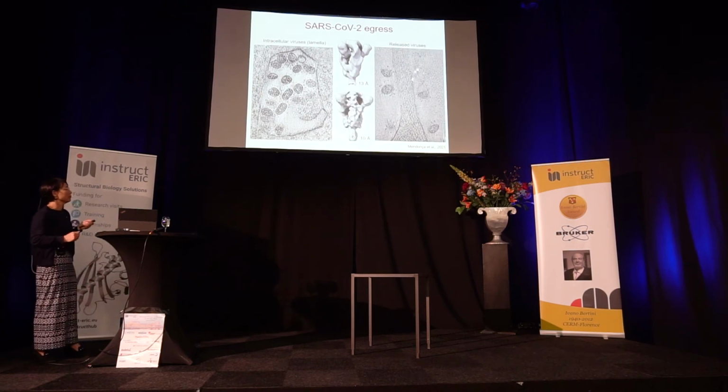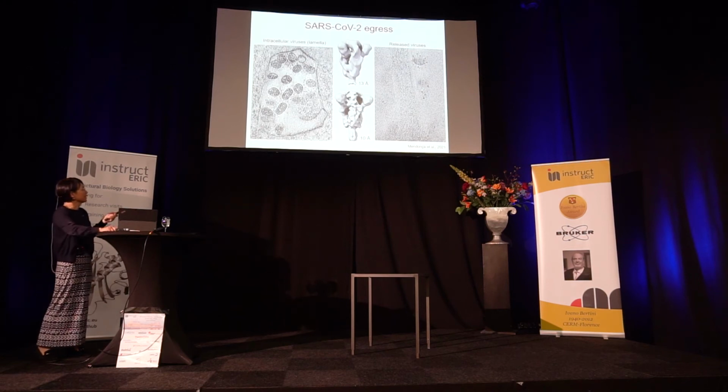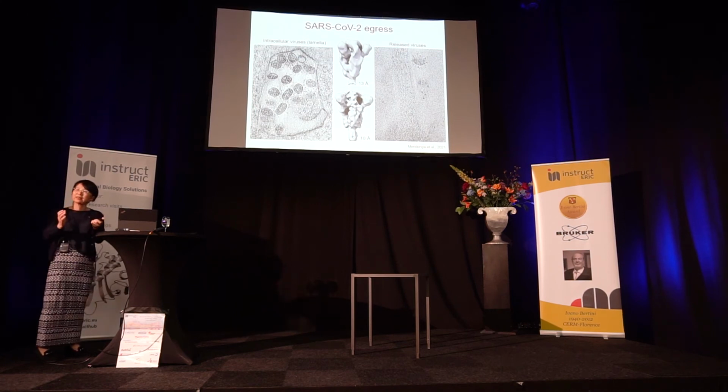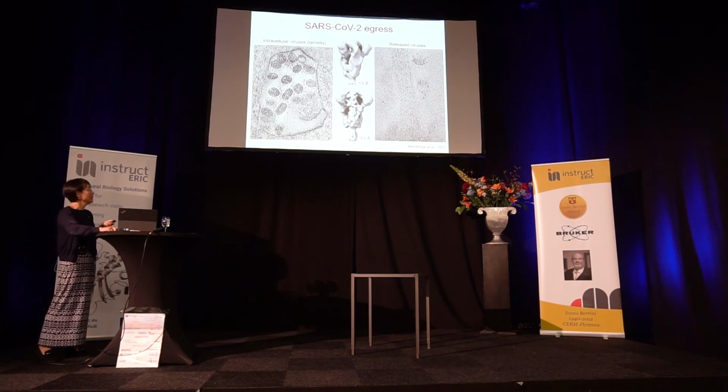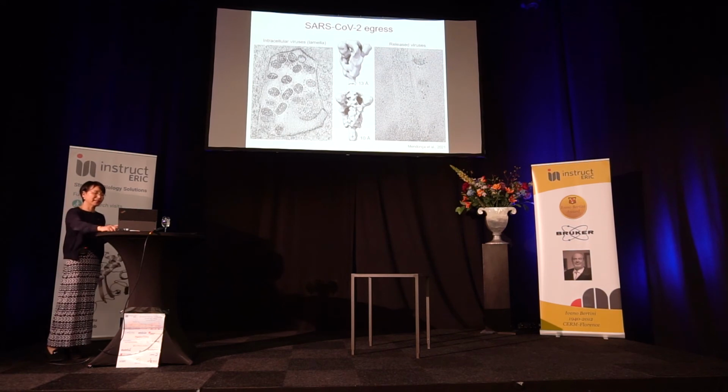We were also able to determine spikes from virus particles that have just exited the cell, in the extracellular space, lining next to the cell membrane. We get a 10 angstrom resolution, and you can tell the two spikes look very similar. There's no significant change between the intracellular spikes and those outside, and there are no post-fusion spikes there. We also wondered about the spikes being used for vaccine development.